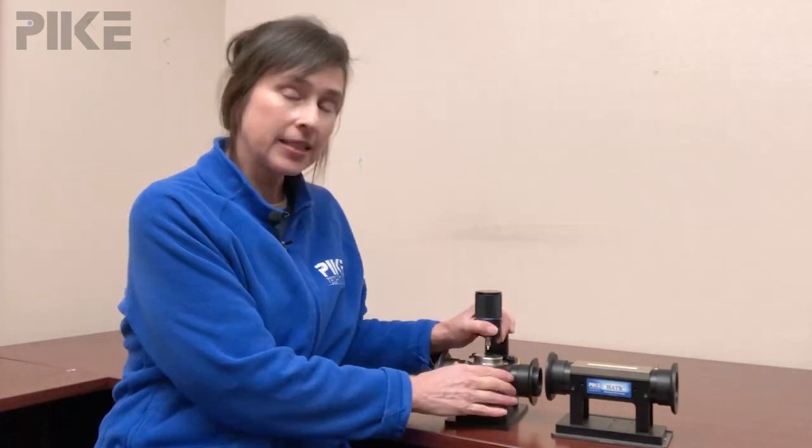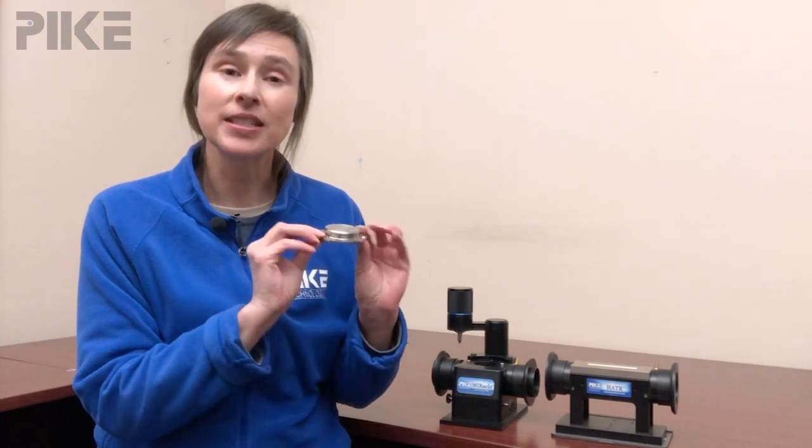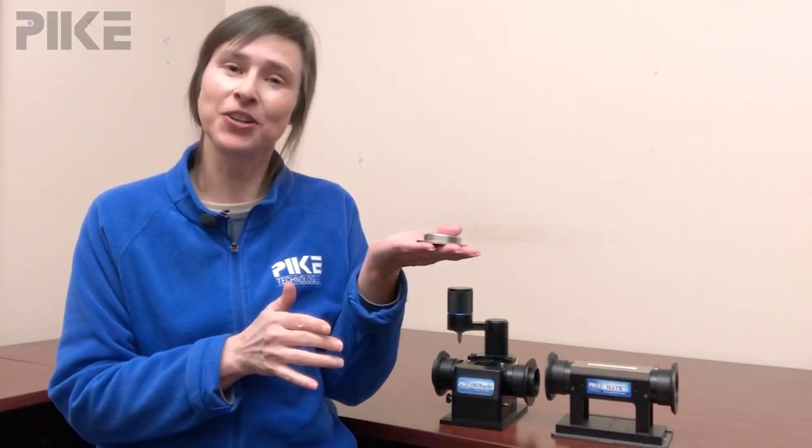However, if you do find that you need your zinc selenide plate or any of our ATR crystal plates repaired, we do offer a refurbishing program. What that means is you take the ATR plate off your accessory, send us the plate, we'll pop out the crystal, put a new one in, and you're running again.